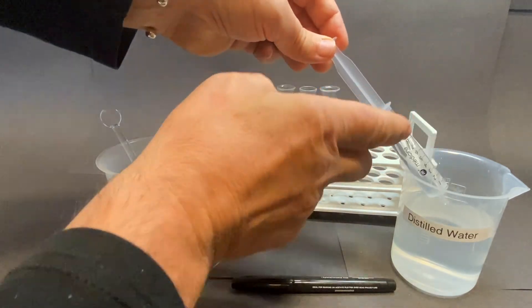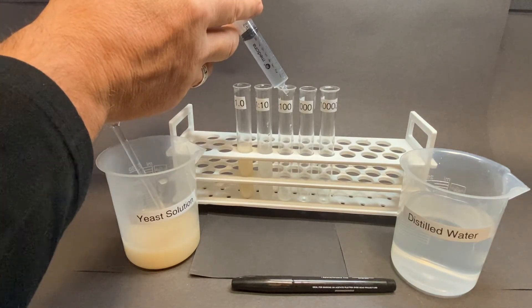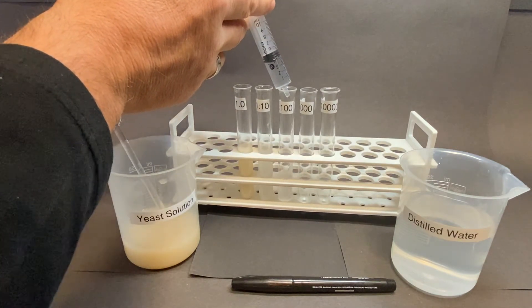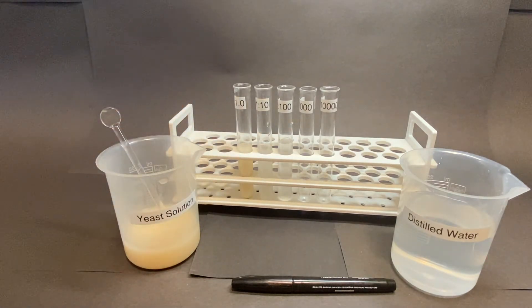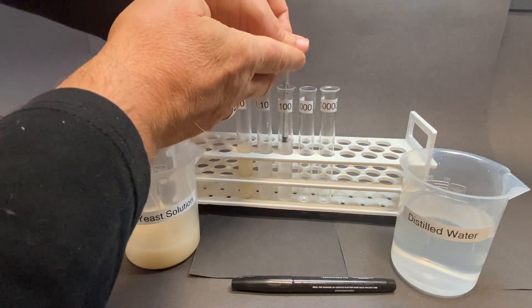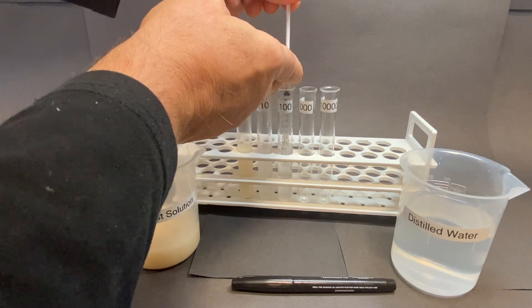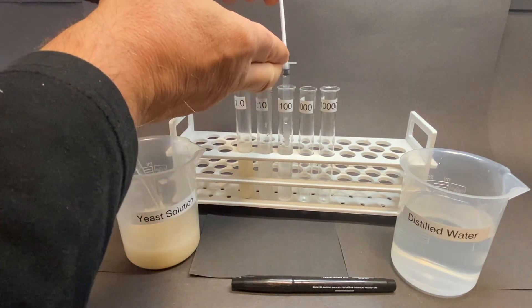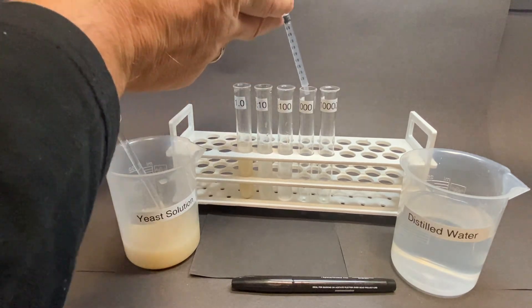Once again, adding 9 milliliters of distilled water to the 1-milliliter sample ensures a 1-in-10 dilution. This will give a 1-in-100 solution. Repeat the process from the 1-in-100 dilution and continue until the series is complete.